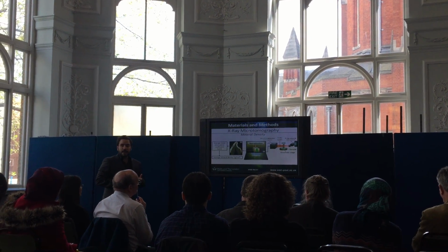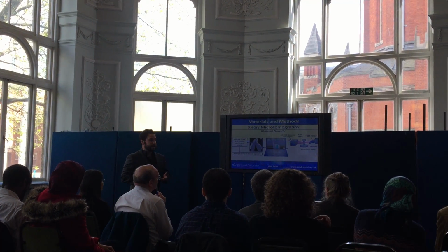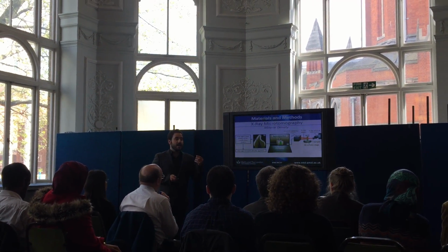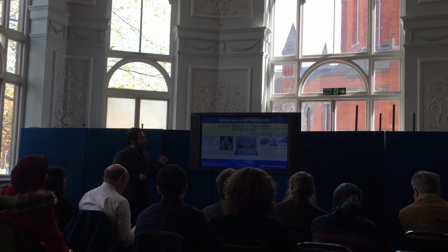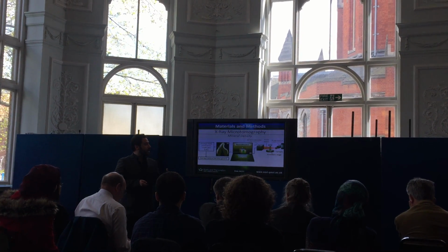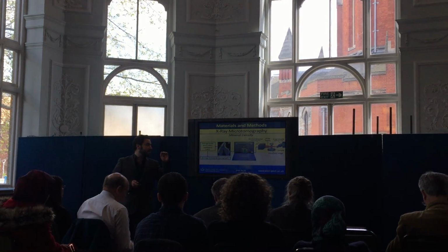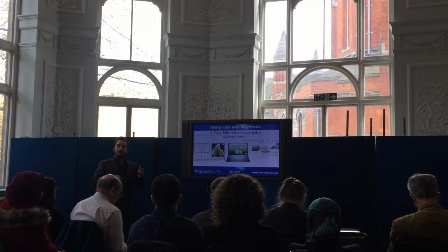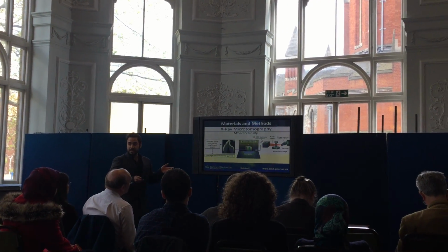The first technique I applied was X-ray microtomography, which is just a mini version of a CT scan. Here, the sample rotates, and at each sequential rotation, it's bombarded with X-rays. The attenuated X-ray is detected by a detector, and then the sinograms produced are reconstructed into a 3D model, and from that 3D model we can get slices like this. Each pixel of this image has a specific linear attenuation coefficient. From this value, we can deduce the average mineral density of this pixel.